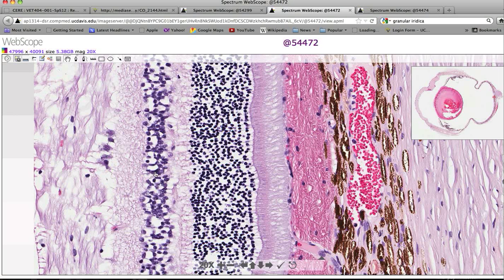We've got the inner nuclear layer, then another synaptic layer called the inner plexiform layer — axons of the inner nuclear layer synapsing with the dendrites of the ganglion cells, which are here. Ganglion cells are really the only cells of the retina that look like a classical CNS neuron. They're kite-shaped, they've got granular cytoplasm filled with Nissl substance. Other cells are present in the ganglion cell layer area, so just be aware that they're not all ganglion cells. We rely on the kite-shaped and basophilic nature of them to identify them as ganglion cells.